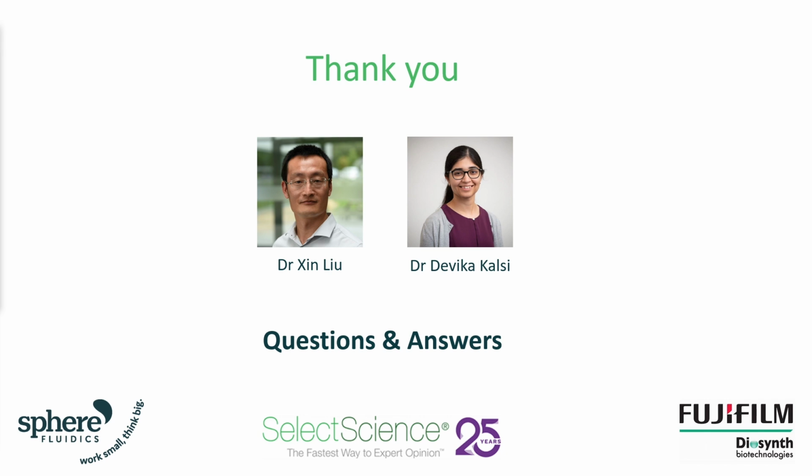Yeah, thank you. Good question. In terms of the overlap of the scatter plot in that standard experiment, there is a known phenomenon when you do the binding assay called the hook effect. Essentially, if your target molecule goes above a certain threshold, you'll start to see a drop in the assay signal. So that's why you see those two high concentration populations start to overlap. But what we see is that the incubation window and the assay dynamic range is good enough to allow us to reliably detect secretion from either CHO cells or other cell types, for example, hybridoma cells or primary B cells.